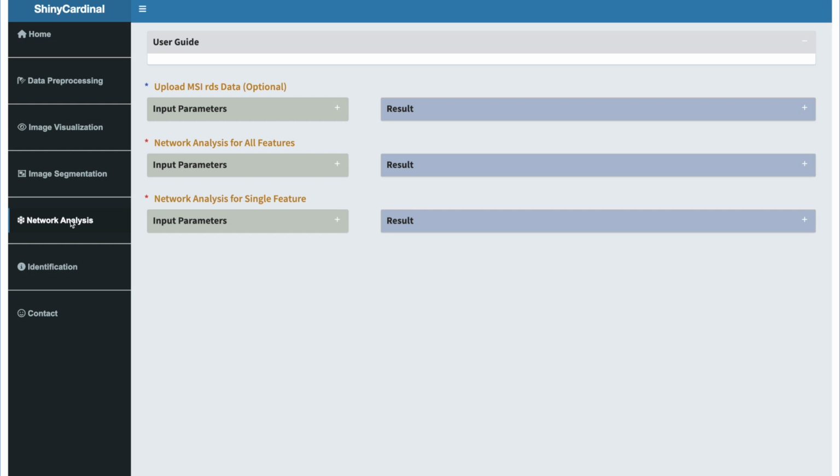From a metabolomics perspective, one can regard mass spectrometry imaging as performing an MS1 level shotgun metabolic profiling at each pixel. Thus, due to the lack of MS2 in most mass spectrometry imaging studies, MS2 similarity-based molecular networking cannot be applied for mass spectrometry imaging datasets. However, it is also possible to group molecules with correlative spatial distribution into clusters. This is based on the assumption that functionally related molecules are spatially correlated.